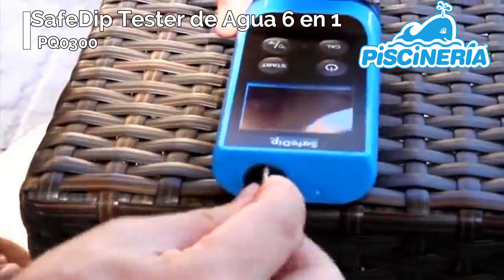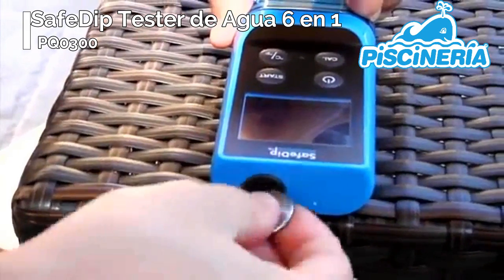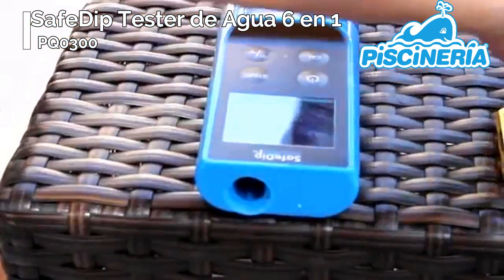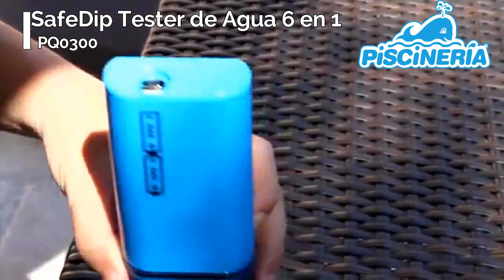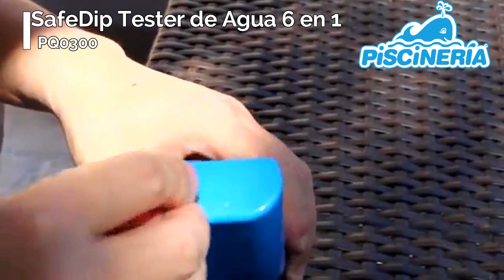First, insert the batteries into the tester as shown on the body. Use a quarter or a screwdriver to unscrew the battery cap. Then note the printed batteries on the back of SafeDip — they will show you the correct way to install the AAA batteries. Then reinstall the battery cap.